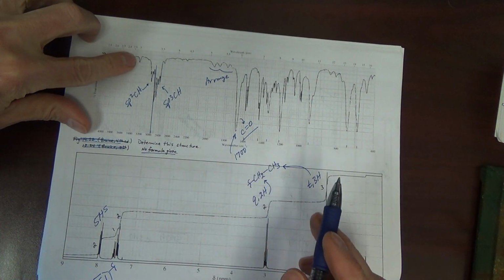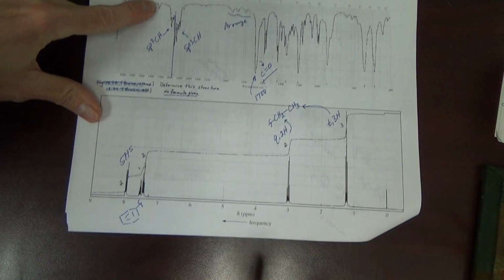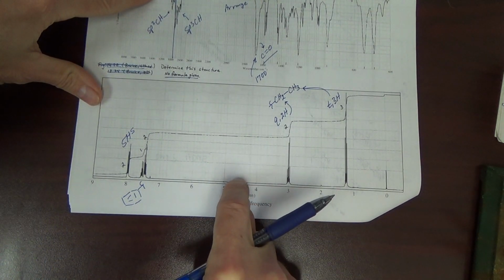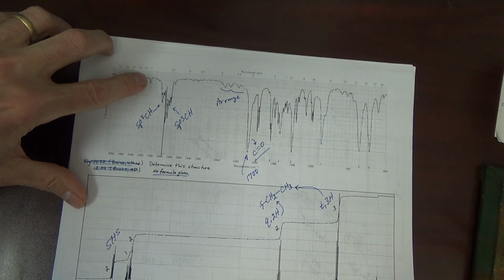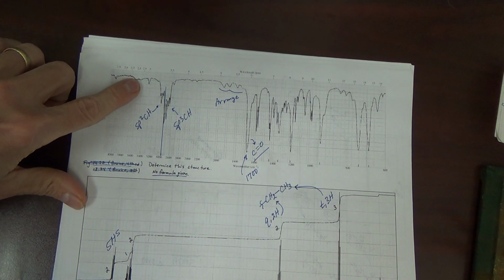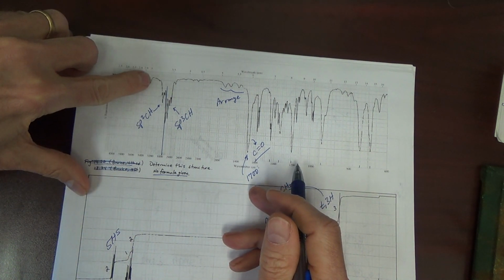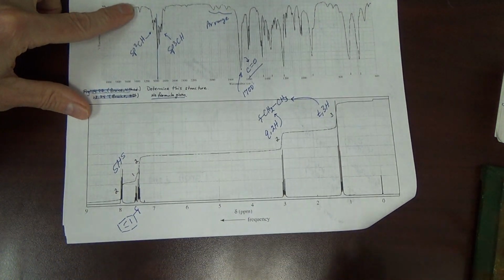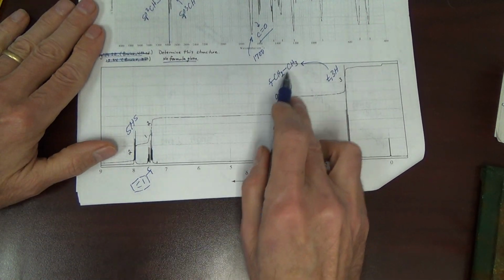What is this here? Could that be an NH? Well, think about it. If that was an NH, we should see that hydrogen in the HNMR. No, there's no other H. That's not an NH. That's not an OH. It's probably an overtone of the carbonyl. 1700 times 2 minus a touch, 3400 minus a touch. Likely an overtone. Both of these are accounted for either in the ring or the saturated ethyl group.